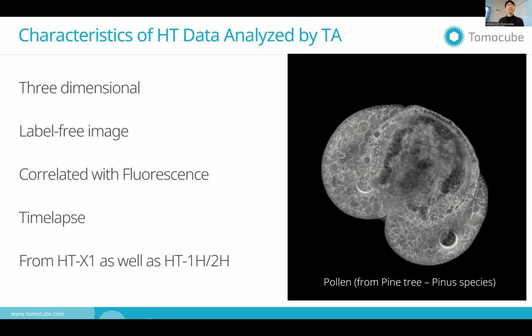And as I said, the data can be acquired from HTX1, which is the recent one, as well as the former one, HT1H or 2H. So we take into account the compatibility in data analysis. So those are the basic characteristics that the TomoAnalysis should handle, and we wanted to focus on those features.